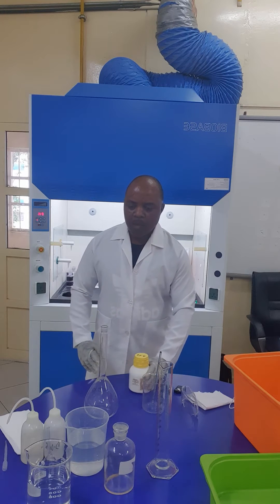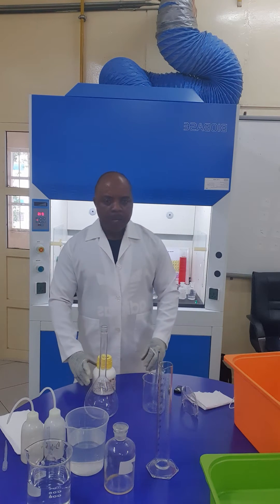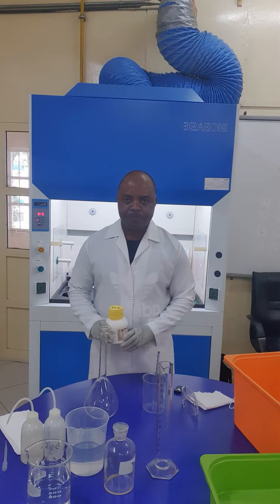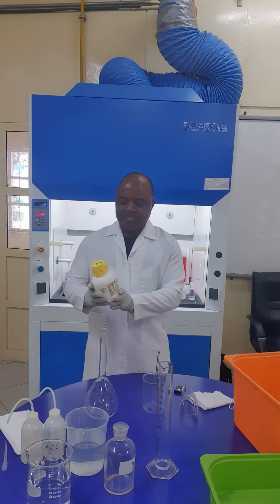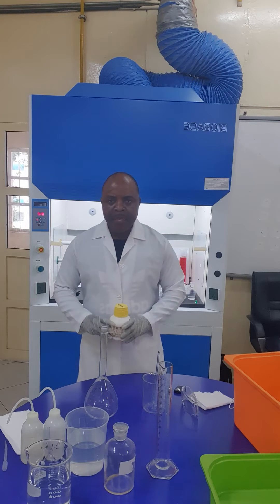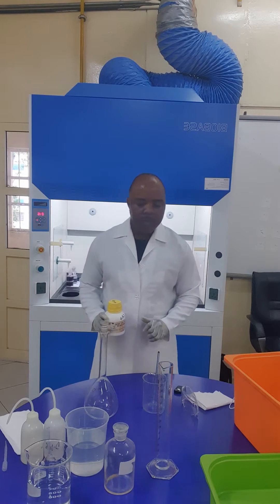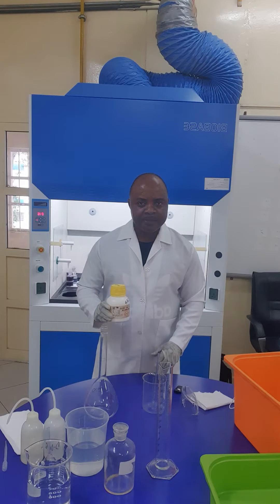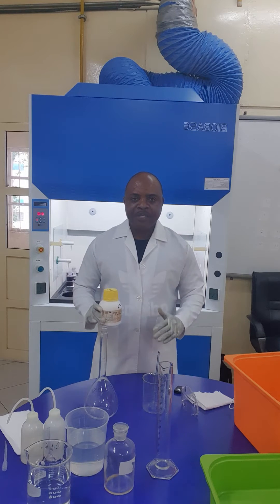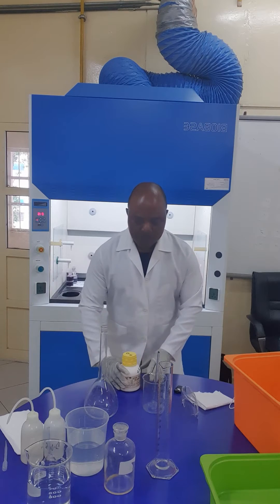Welcome back. We want to continue from where we ended in our previous video. Now we have to prepare a two molar sodium hydroxide solution from scratch. This is from the manufacturer — sodium hydroxide pellets. We have to prepare a stock solution of two molar sodium hydroxide. We need to measure 80 grams of the sodium hydroxide pellets, and we use our balance.